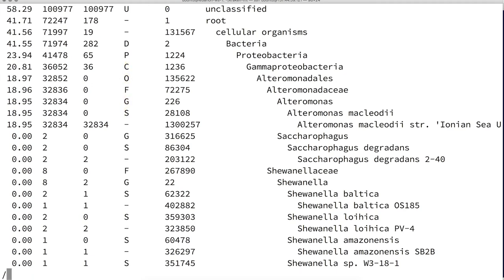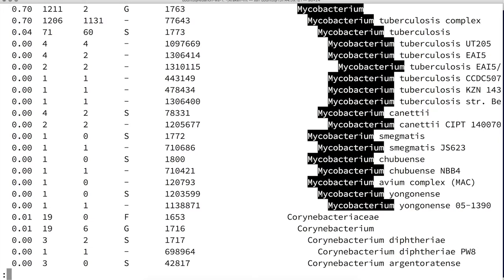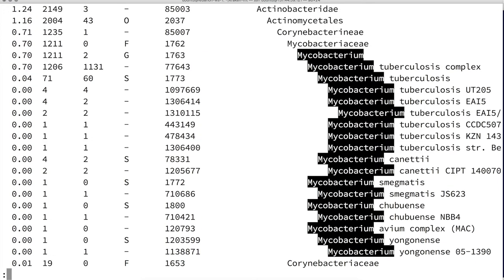We can have a look at the presence of mycobacterium — and yes, we found it. The percentage is not as small. Remember that we are underestimating, because not all k-mers from a genome are specific for the lower taxon. So some reads from Mycobacterium tuberculosis will be classified at higher levels such as Mycobacteriaceae. This is something very normal with Kraken, but if we want to see the presence of something, we are detecting it.